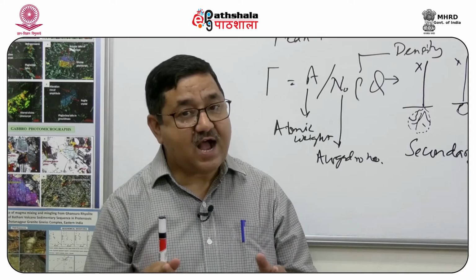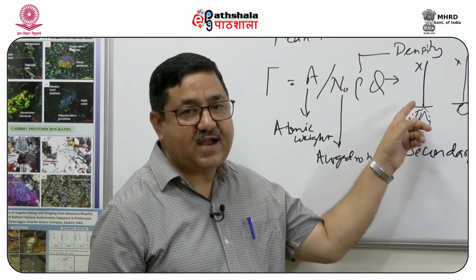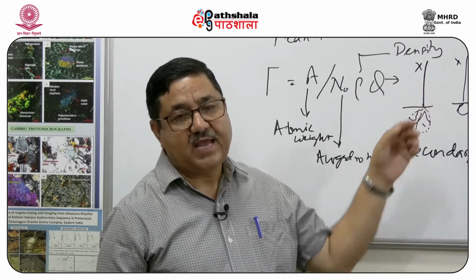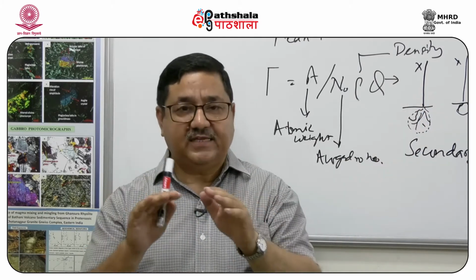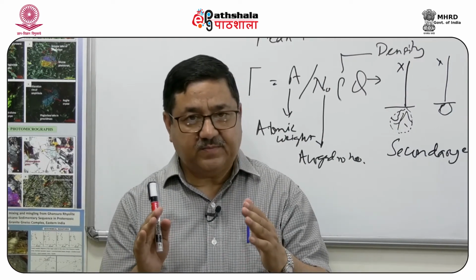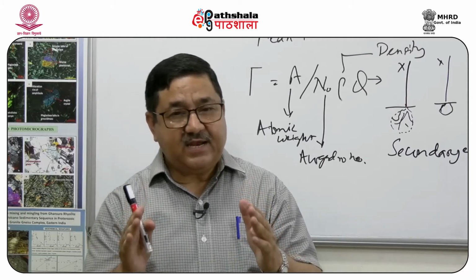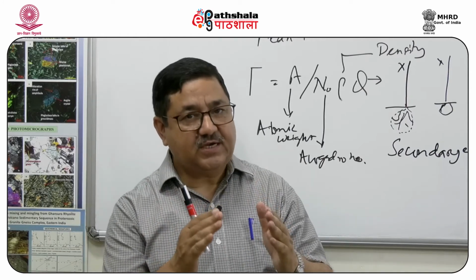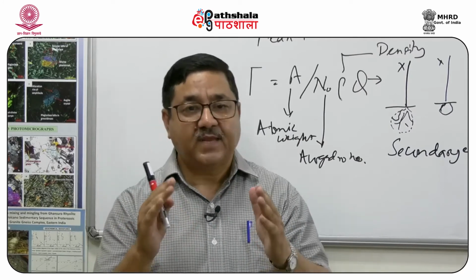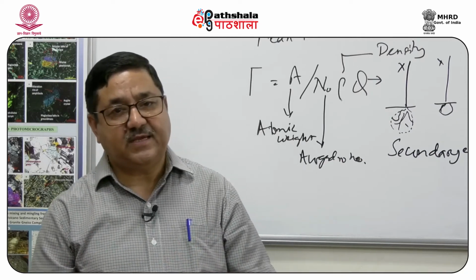Now, those are very useful because they come out from the top surface of the interaction volume, and they define the shape and the figure of the interaction volume, and they are used as a very nice criteria to distinguish at high resolution, and we will discuss resolution subsequently, the material which we are examining.